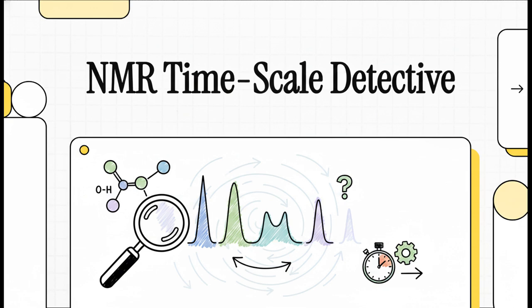But there is one notoriously frustrating suspect that has baffled so many of us, and that is the unpredictable, wandering hydroxyl proton. Seriously, sometimes it shows up as a sharp peak, sometimes it's just this wide, blurry bump, and other times it seems to literally disappear completely. So why does it do this? And more importantly, how can we control it? Well, that's exactly the mystery we're going to solve today.